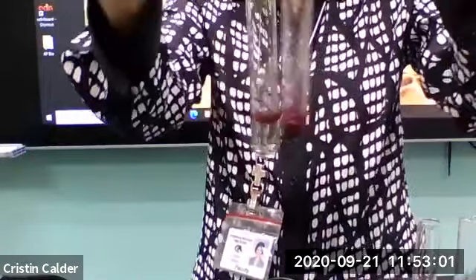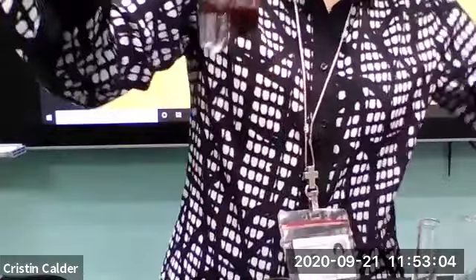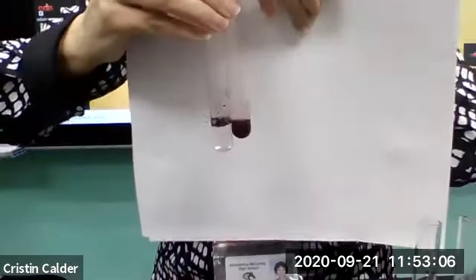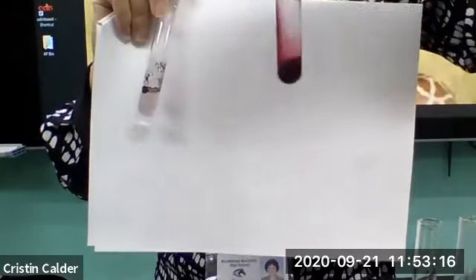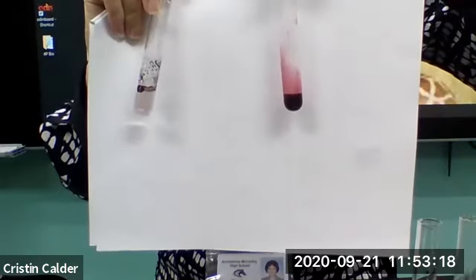So the difference here, again, I can put a piece of white paper to help you see it better. Sudan IV in water is insoluble. It literally stays a powder. It's just floating there on the top. But in oil, it actually dissolves. This is actually now a deep pink solution where the Sudan IV has dissolved, all right? So that's our four standards.